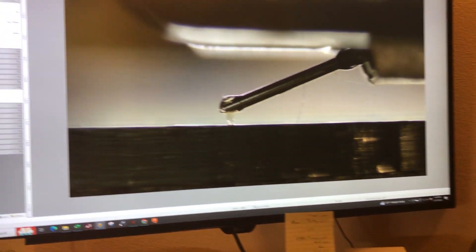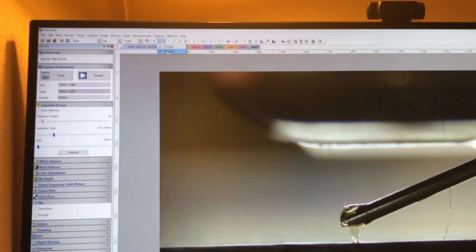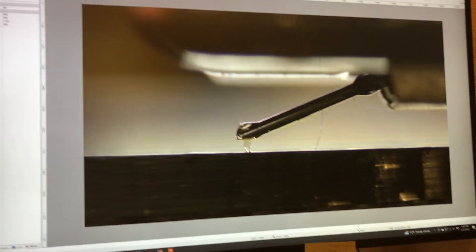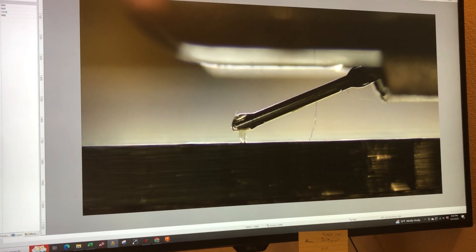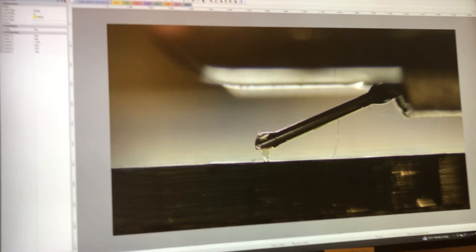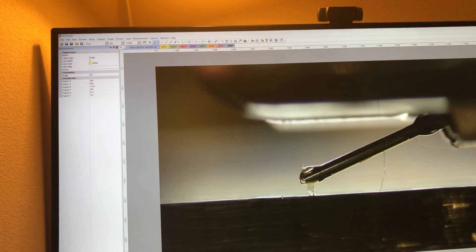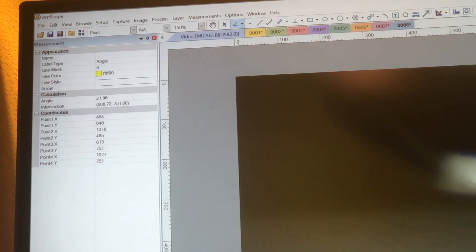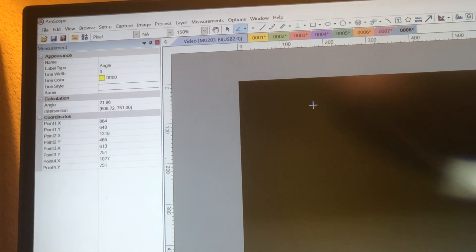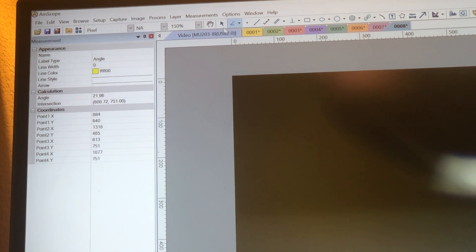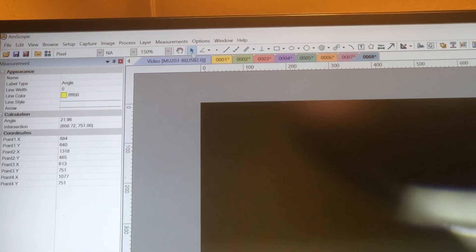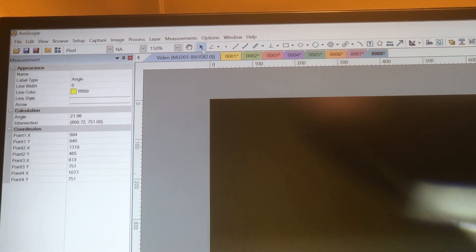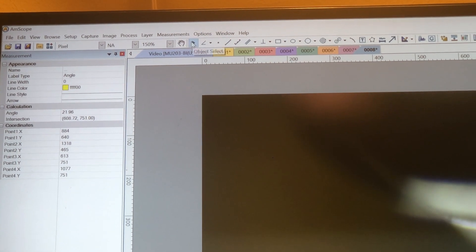And then when you do draw your lines, of course up here go to your four point, choose the four point, drop the line. You can just do it roughly at this point, drop it. First of all you have to change to the handler, up here you see this arrow up here.